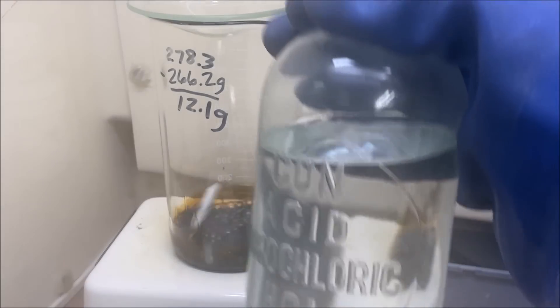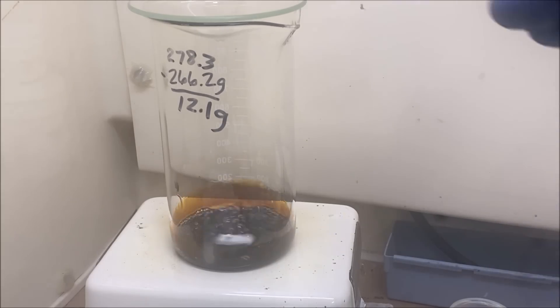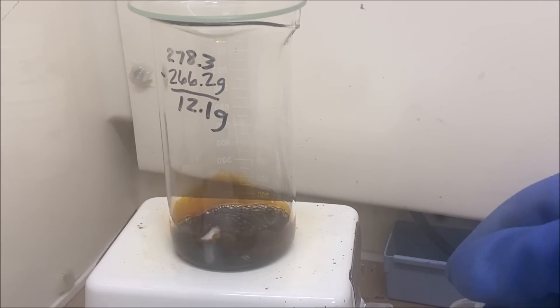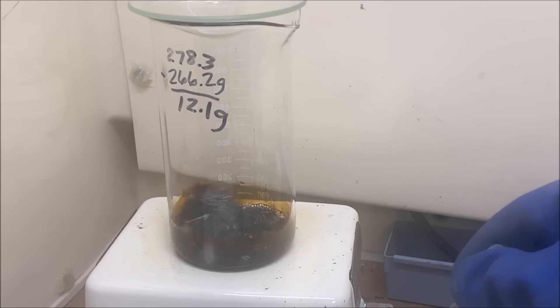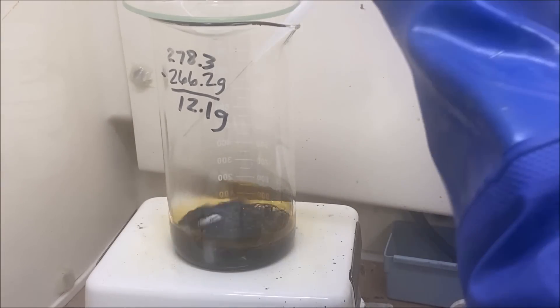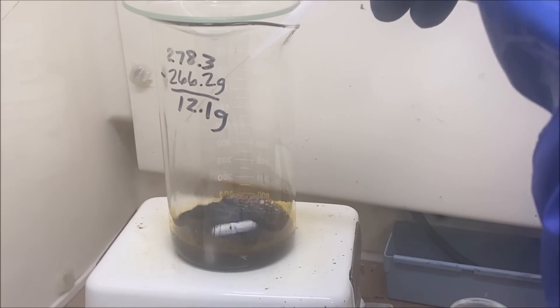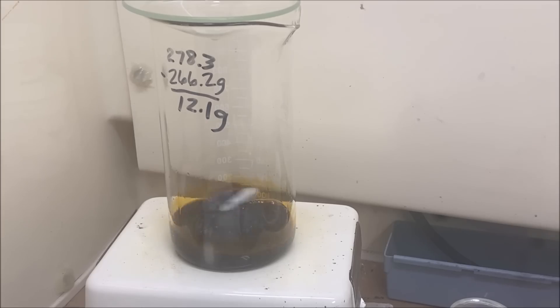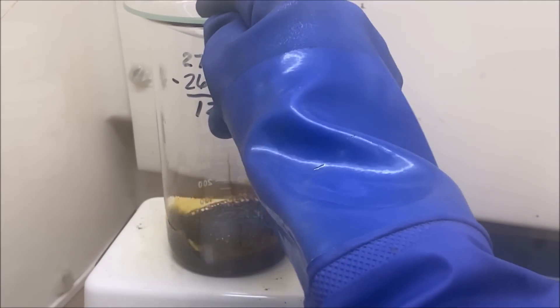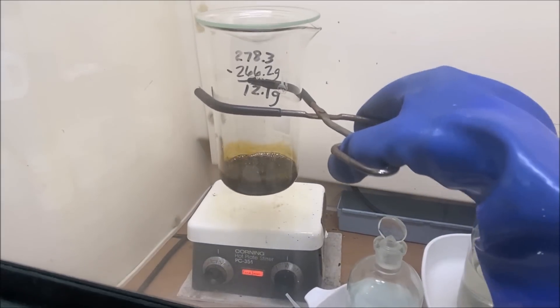I've evaporated the solution down a third time, and what we'll do now is add some more hydrochloric acid to rehydrate. If you notice, there's hardly any fume production at all, and that's a pretty good indication that we've got all of the excess nitric expelled from our precious metals in solution. Now that we've successfully denoxed the solution — denox means remove all the excess nitric — we're going to pull it down and let it cool.